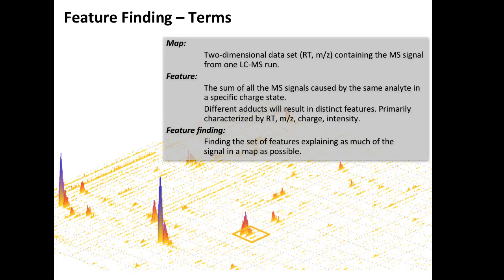Well, we usually see tens of thousands. And you would be surprised. The problem really is that mass spectrometry is really, really sensitive. So if you take distilled water, even if you distill it 3-4 more times, you will see thousands of things that are in there.